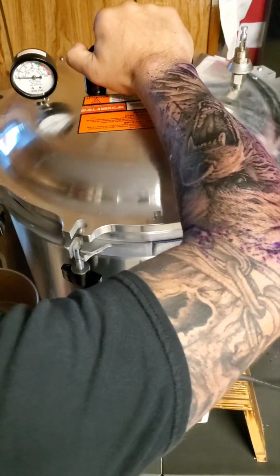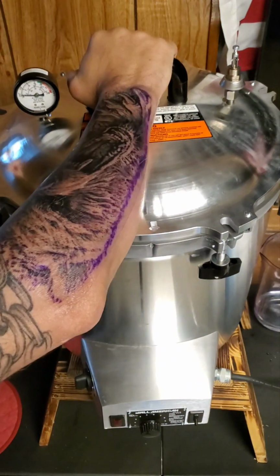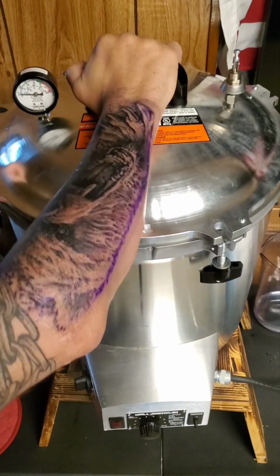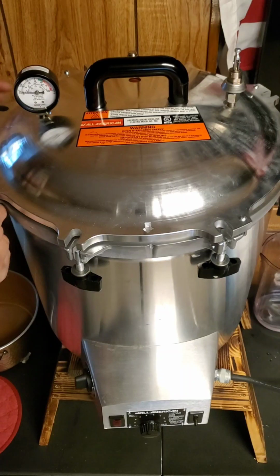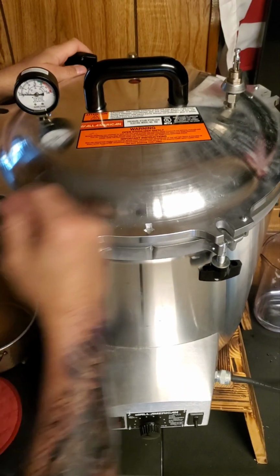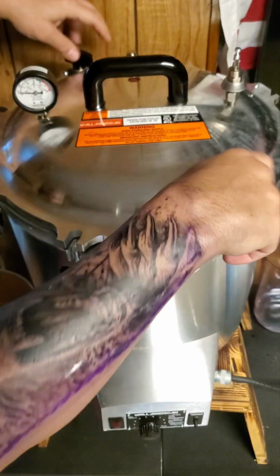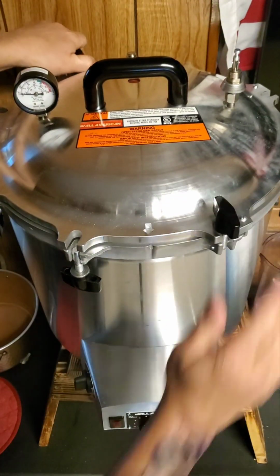A little too far to the right. Line it up. And you'll see the arrow here lines up with that. Has these little latches to lock in. I just make sure that's open because it's already starting to gather pressure. I go with the two across from each other. Everything's off right now.